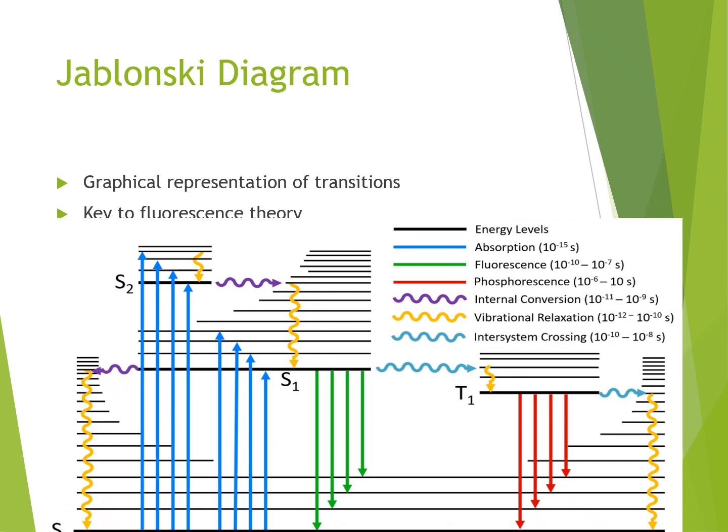Internal conversion is the transition from one singlet state to another singlet state. And here some energy before emission is used in vibrational relaxation.